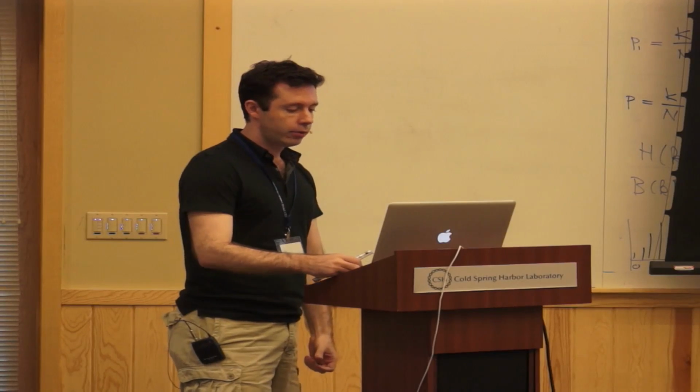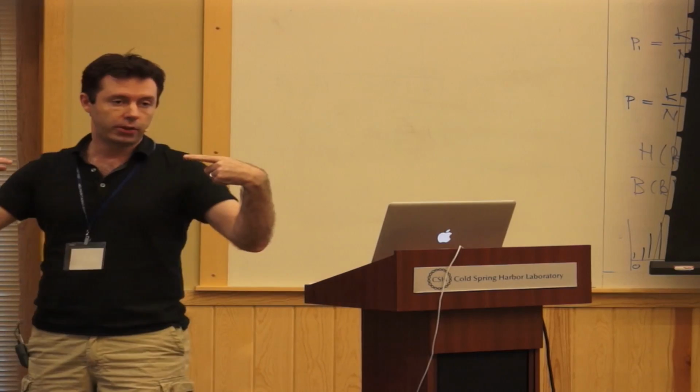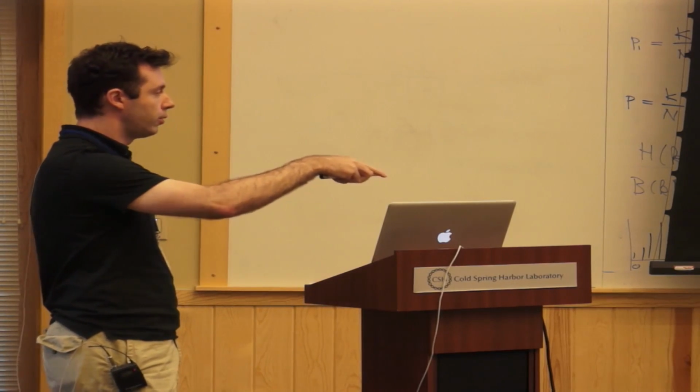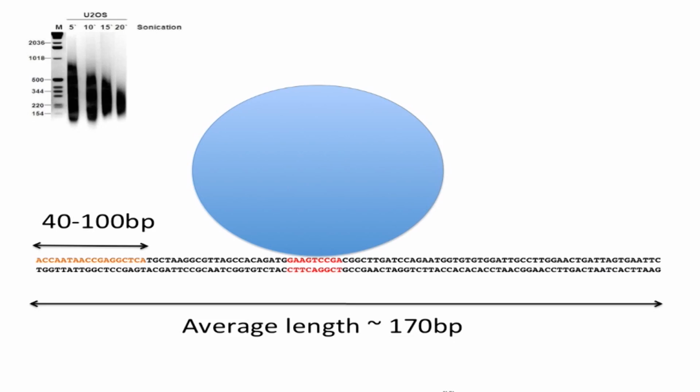But what I also want to illustrate is that with Illumina sequencing, we're not sequencing entire fragments. It's actually doable to sequence with longer reads like this, but there's no good reason to do this. What you typically do is sequence one extremity of a DNA fragment.